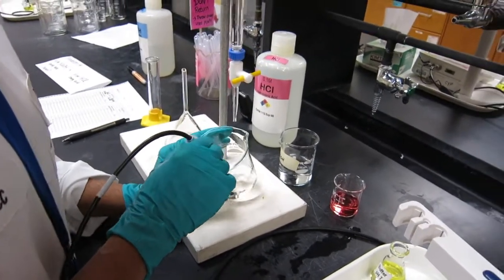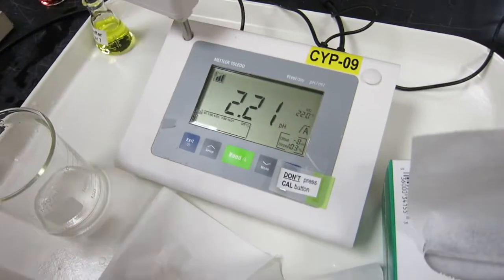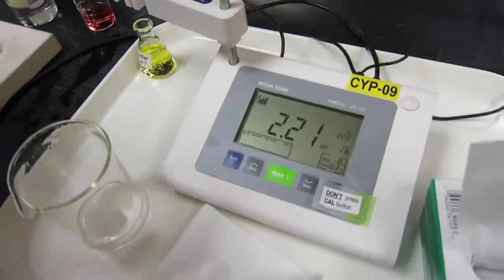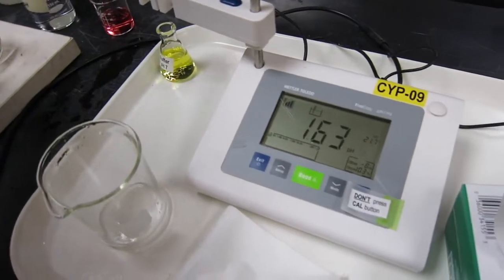We wipe it to remove any excess solution. We measure the 0.1 molar HCl. Press read. Keep it in.